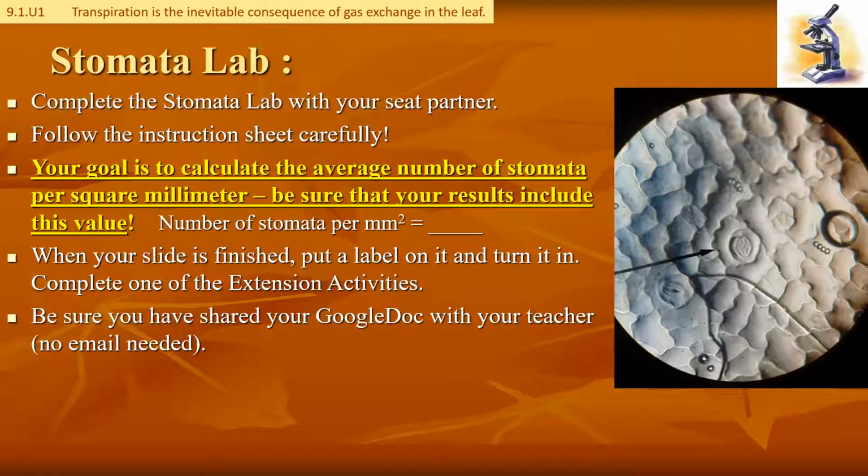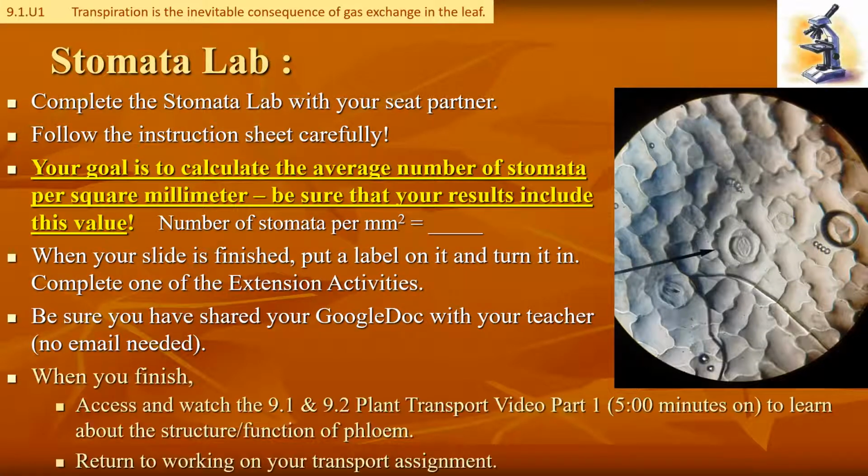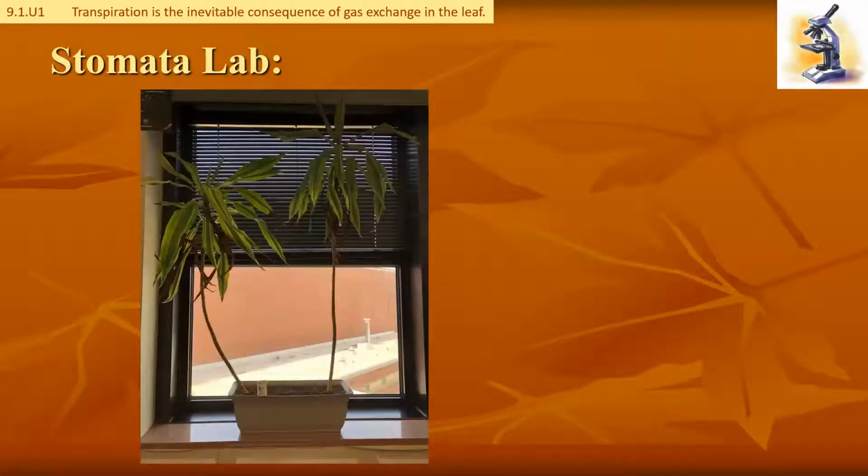By the end of the period today, you should be done with this lab. And so make sure that you've shared your Google Doc with me. And then there'll be a few things that you can work on in the time you have remaining that I will talk about here in just a moment. You are all going to be using portions of a leaf from this plant that you can see in the back of the classroom. And at this point, I'm going to actually demonstrate a few of the things that you're going to do with this lab.